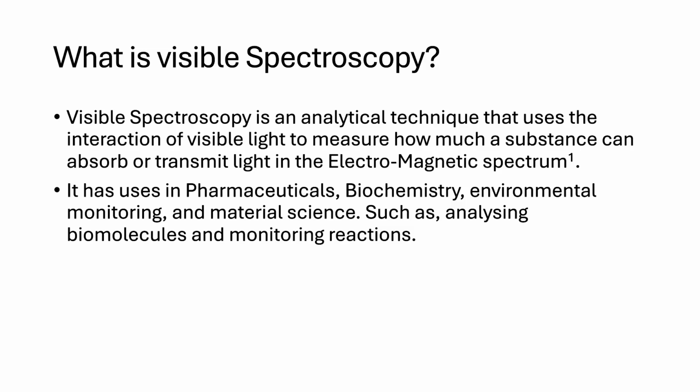So it has multiple uses in certain fields such as pharmaceuticals, biochemistry, environmental monitoring and material science. And some examples include analyzing biomolecules and monitoring reactions, which could be an enzyme in a system which could cause a color shift, and that could be recorded to see what's happening.